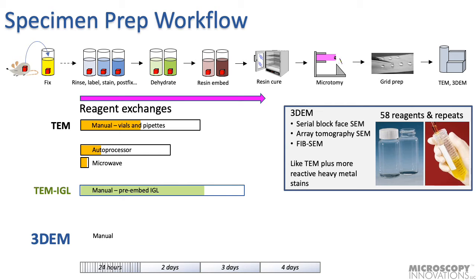The last imaging modality I'll examine is 3D EM. 3D EM preparation is like TEM but has even more heavy metal and reactive reagents for longer times. Preparation takes nearly a full working week and requires about a day and a half of hands-on effort.